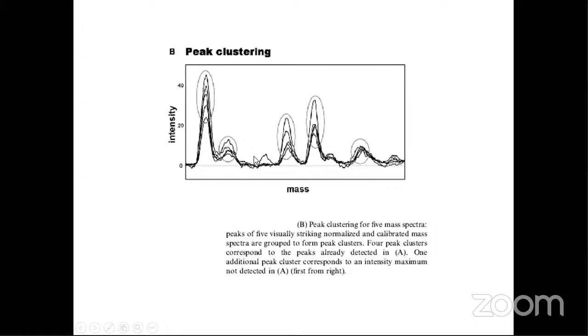But that means if you are going to repeat it many times, you are putting in a lot of time, the expenses are very high, and resource requirements are also very high. As you can see, one time you may get noise as a very big peak, next time you may get it very small. So we will be completely ignoring this.